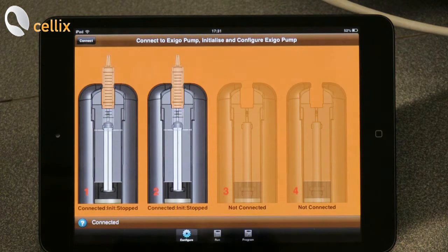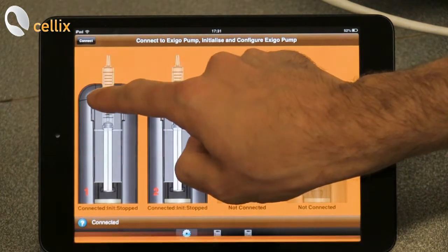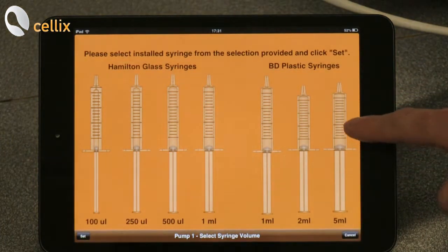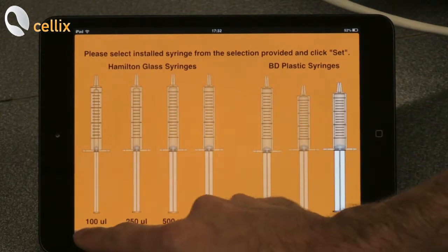The next step is to select the syringe. We double click on the syringe and we select the 5 mL syringe because it's the dimension of the syringe we are currently using. We select the syringe and then click set.